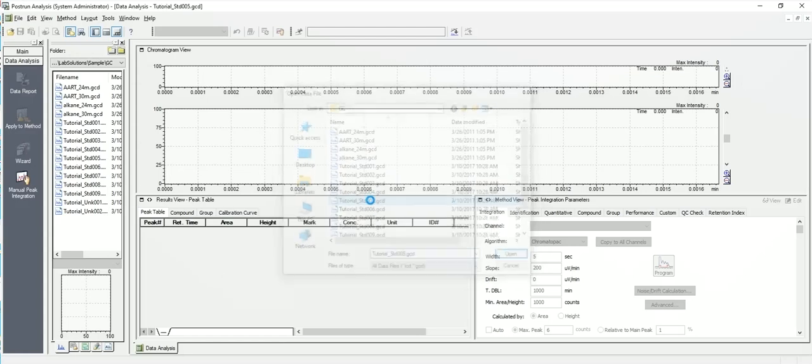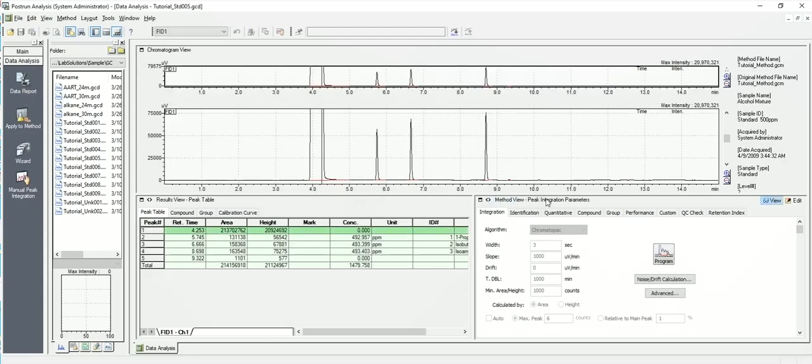Okay, so perhaps our run looks like this. We should be so lucky. The first peak there is probably our solvent and we're going to say that it is.